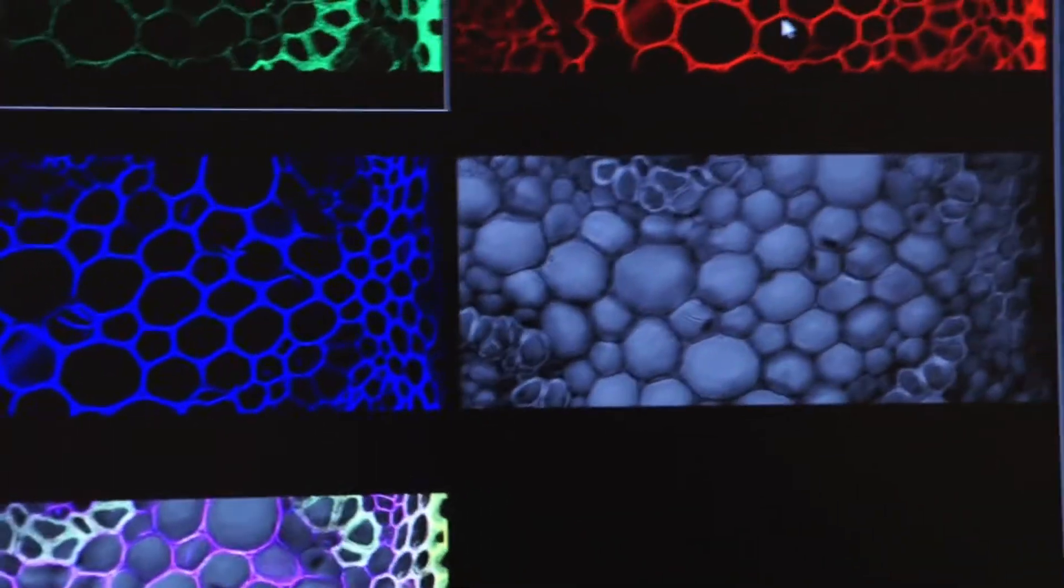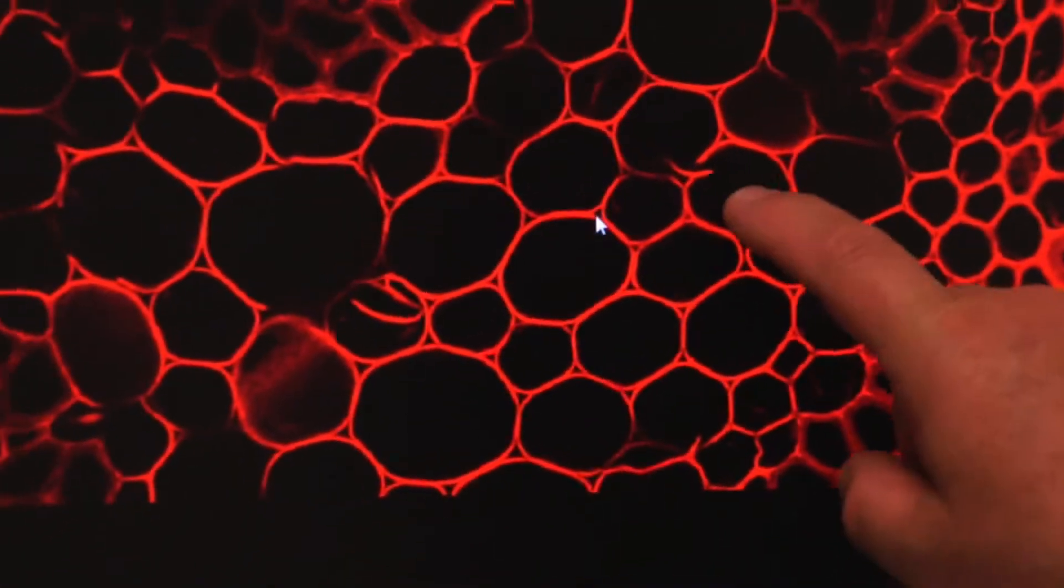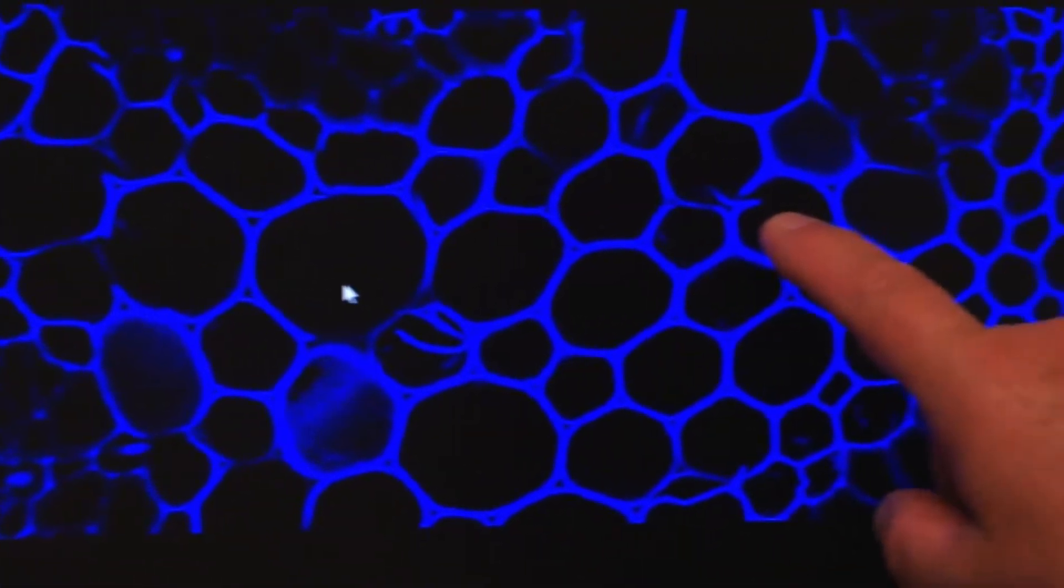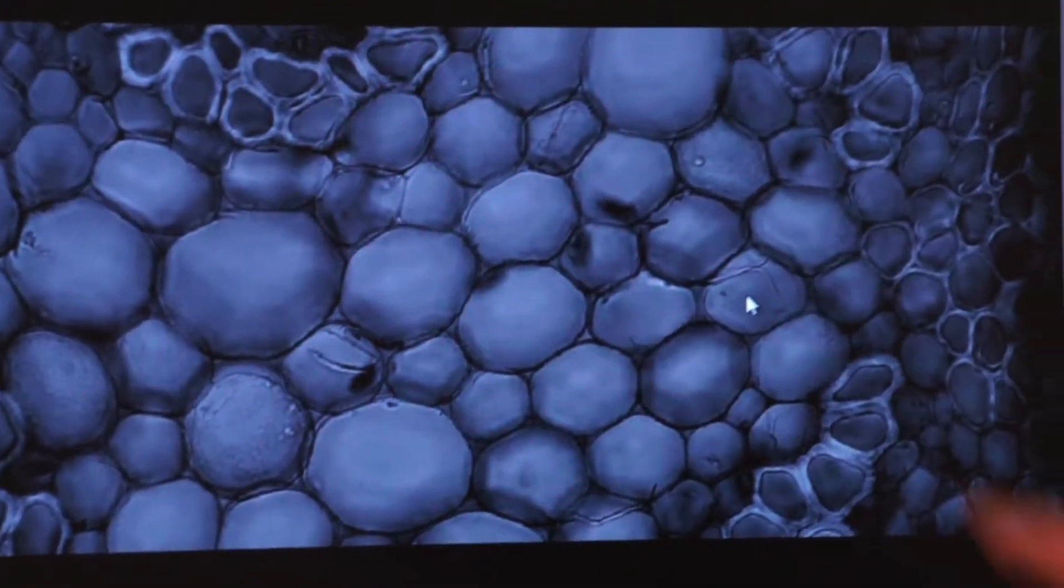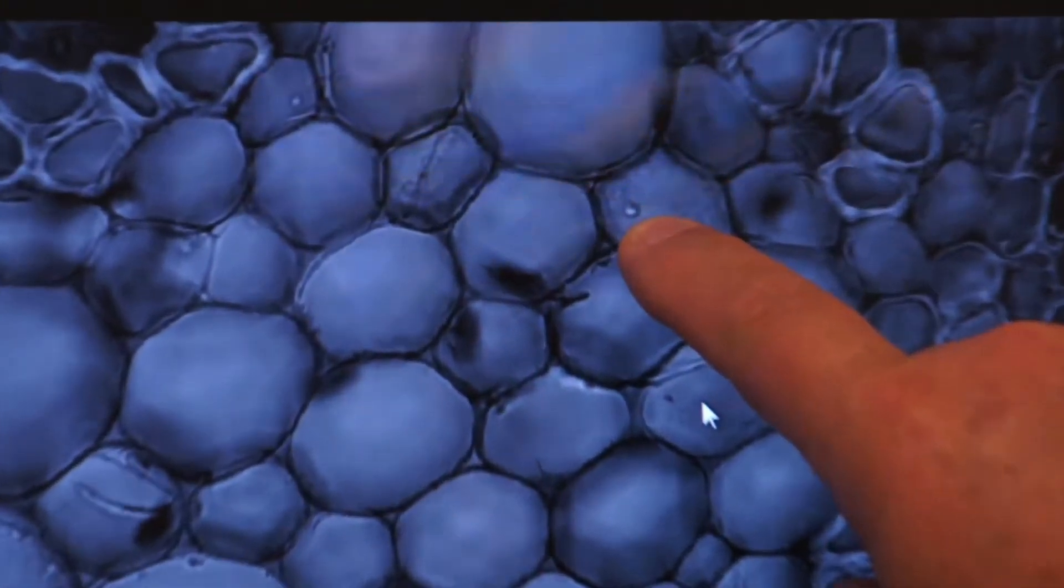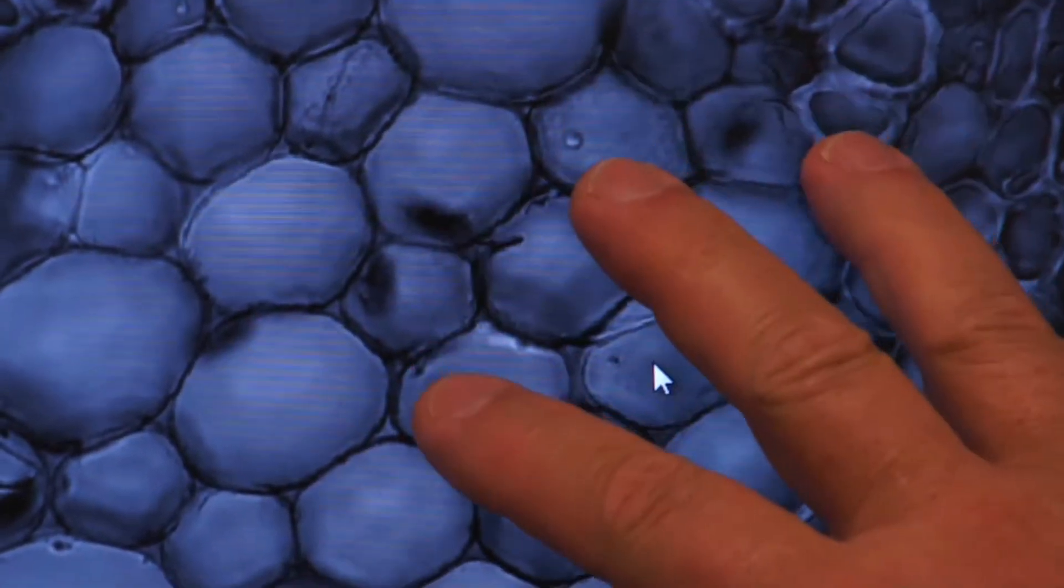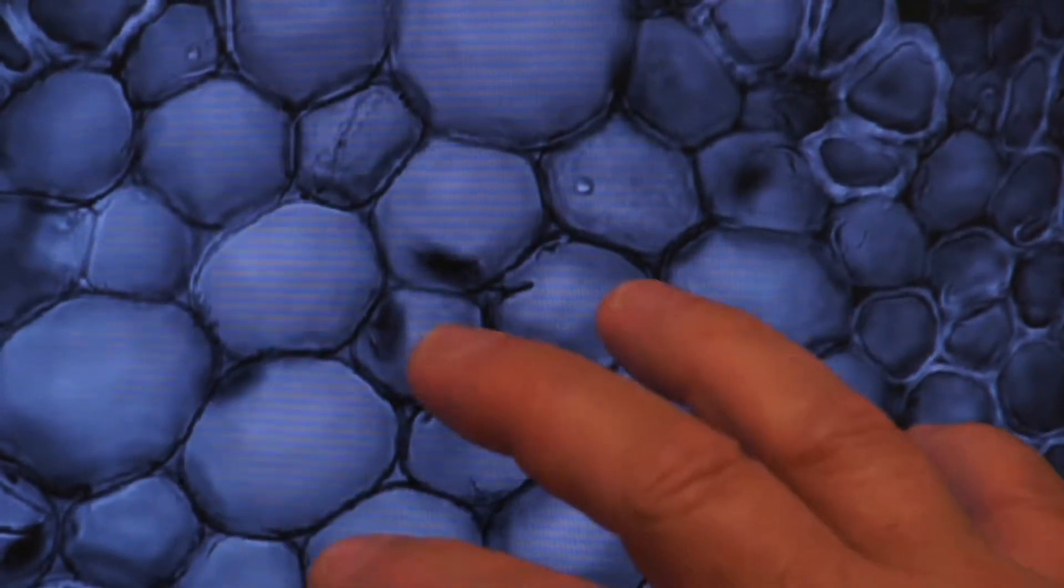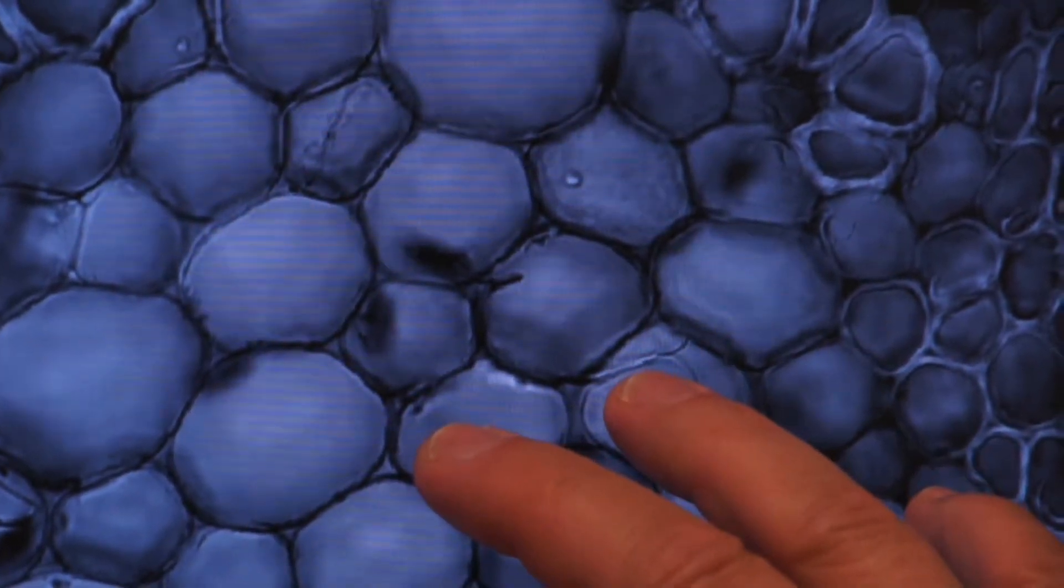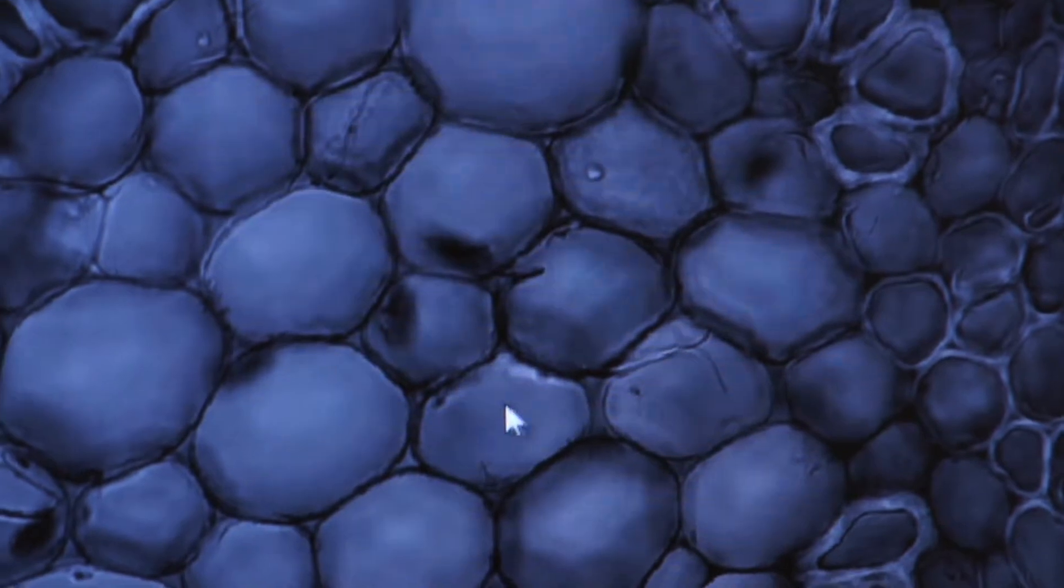What about the TRITC? Same thing, no nucleus. What about the CY5? Once again, no nucleus. But if I go to the transmitted light PMT, voila, there's my nucleus. So sometimes there are structures that you need to see present in your specimen that will not be illuminated by a fluorophore. And so it's important sometimes to use all four PMTs. Then you get a true picture of everything that's going on in your specimen.